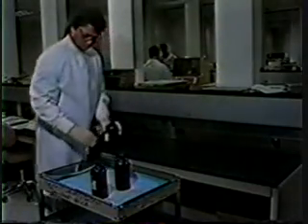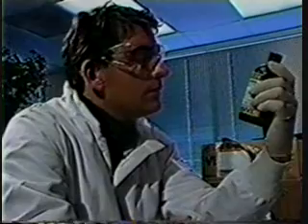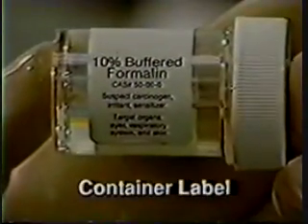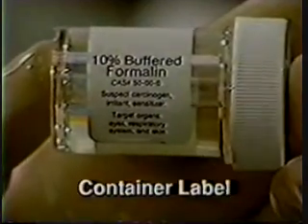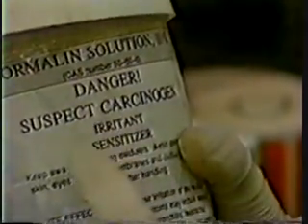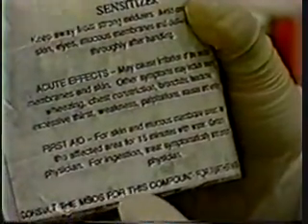All chemicals need to be handled with care, but hazardous chemicals demand an extra degree of caution. The protective measures we take depend on the hazards of the material. There are several sources of hazard information in your lab. Remember to read the container label before working with any chemical. This label identifies the chemical, its primary hazards, and any required safety precautions.